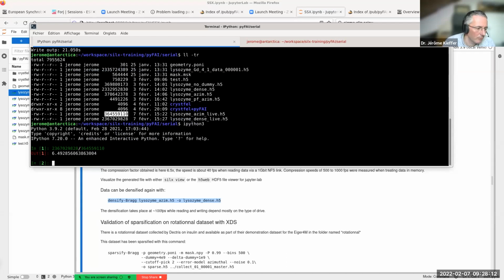So we have a compression ratio of 6.5. So it's close to what we are looking for. Yes, Alexander? Actually, a question about the compression ratio. If you save only those high value pixels, why is the compression ratio so small? I would expect higher compression.